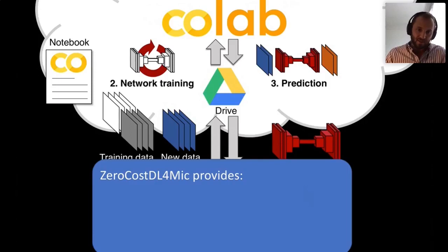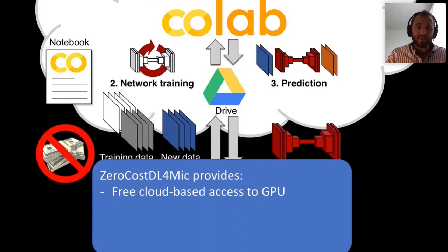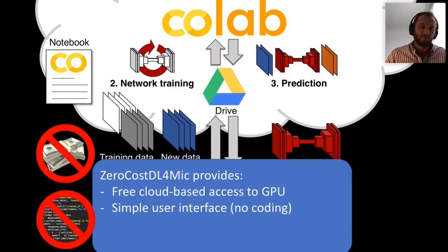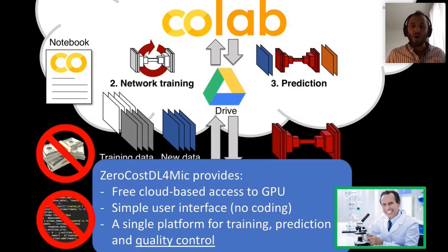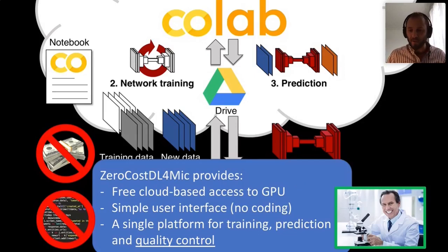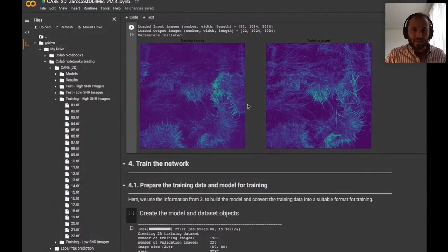Once your data and computation are set up in the cloud, you perform network training in the cloud via Google Colab. You then take the trained model and perform predictions on new data to get your result data. The final step is to download all your data back along with the trained model, which allows you to rerun as many predictions as you want. The platform provides free cloud-based access to GPUs, a simple user interface requiring no coding whatsoever, and in a single platform: training, prediction, and quality control.